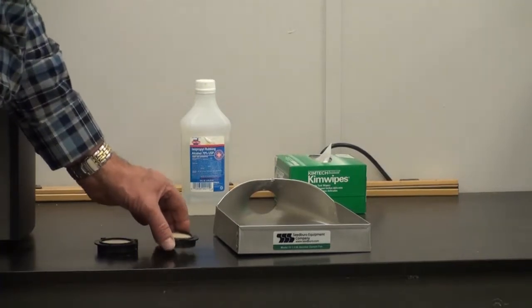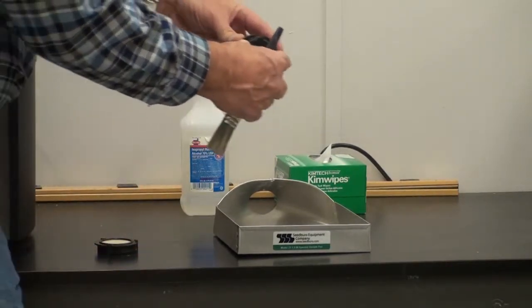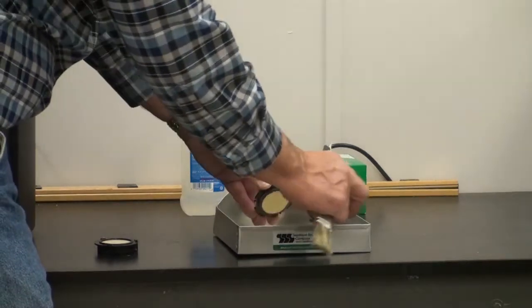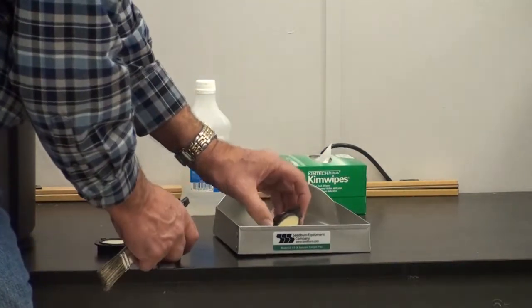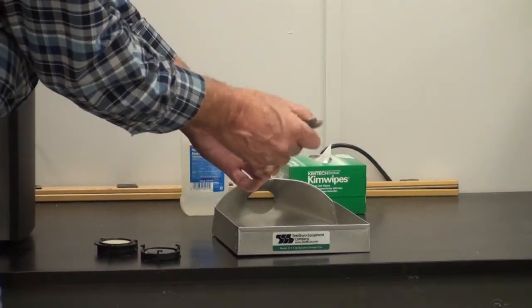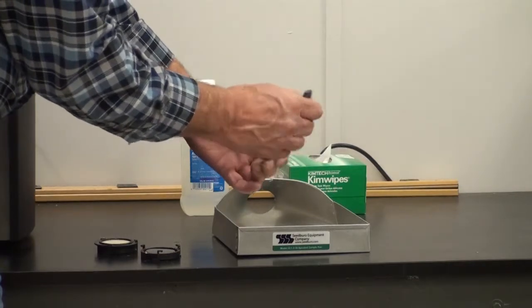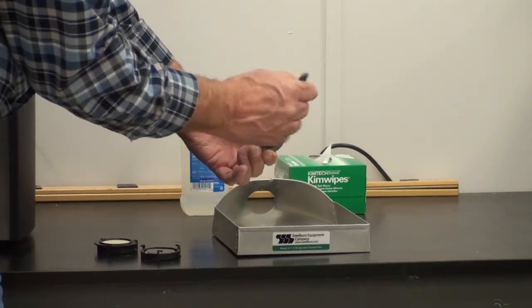All right, after we run the samples, we will be cleaning up the sample cups. I will dump this out. Tap it out best you can. Brush it out with a brush that was in the accessory kit.